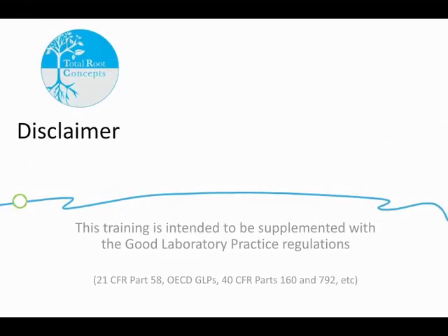Following is an excerpt from one of our customized modules, designed to give you an idea of what an online learning module can look like for good laboratory practices. It should be noted that this training is meant to be supplemented with the GLP regulations themselves. While there are several different good laboratory practices, or GLP, this training focuses on the U.S. FDA GLP regulations covered in 21 CFR Part 58.